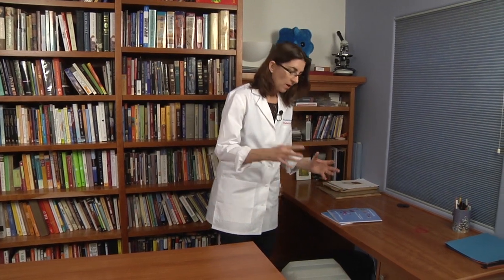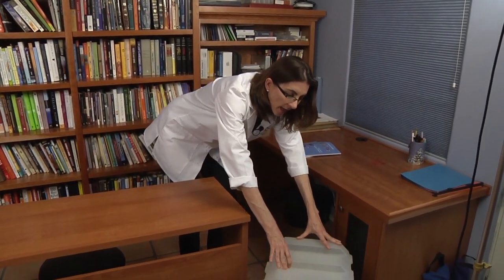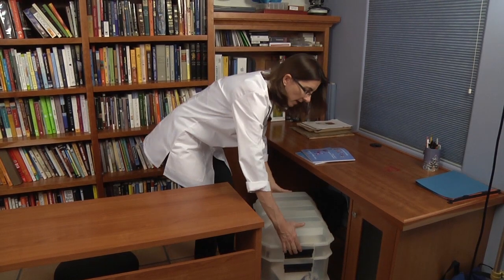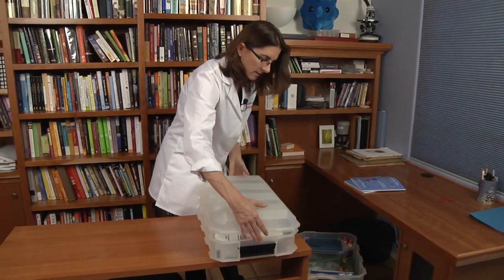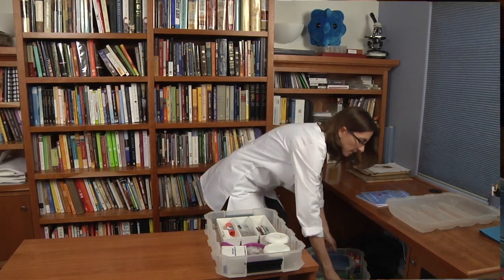When I was homeschooling and doing science experiments with my kids, what I did was purchase a nice bin that could roll, and I could put it under a desk so that it could be stored away. This bin has three different sections to it that lift off, and inside each section I can put different items. Let's take a look at the different items in this bin.